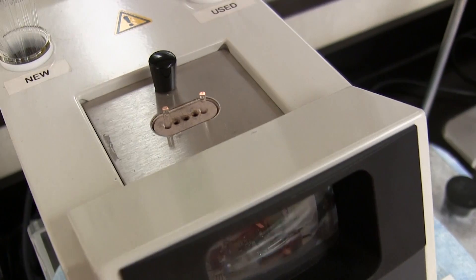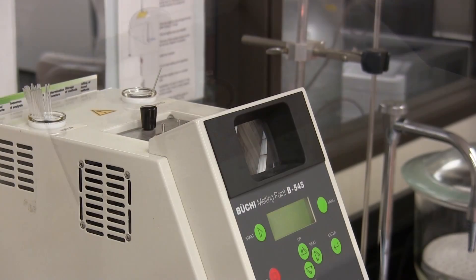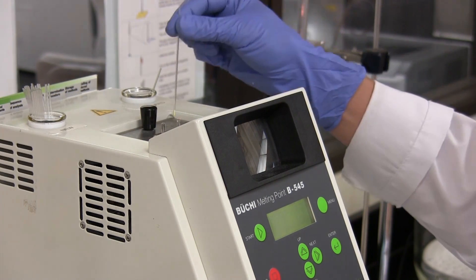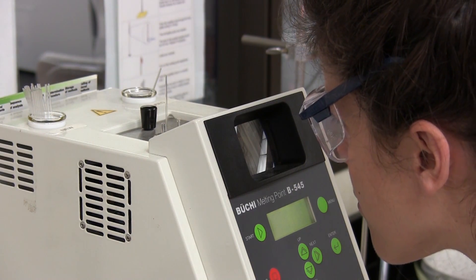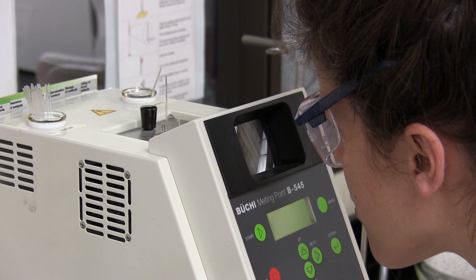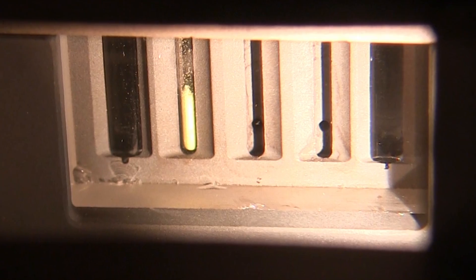Packed capillary tubes can be inserted into any one of the three available holes above the Buki stage. The packed capillary tube is inserted in one of the three available holes and a check is made to ensure that the capillary tube is resting on the bottom. And yes, we see the capillary tube resting on the stage.